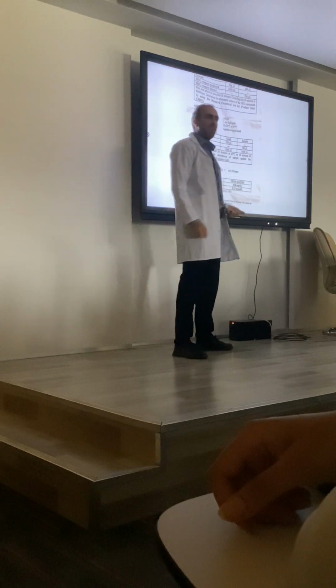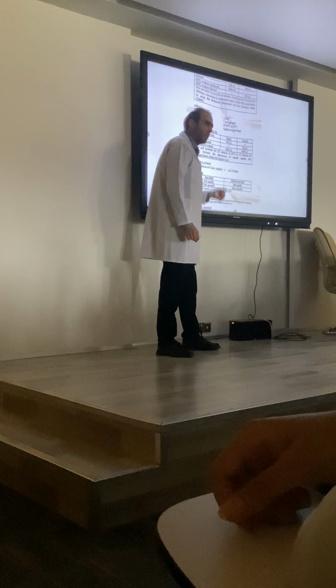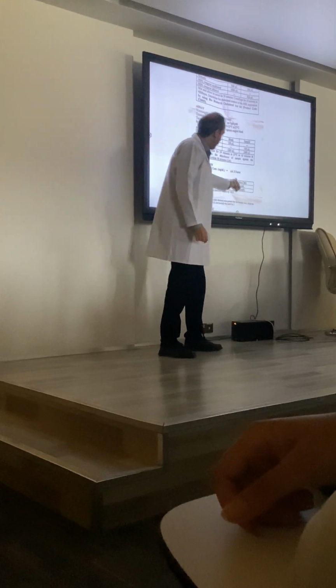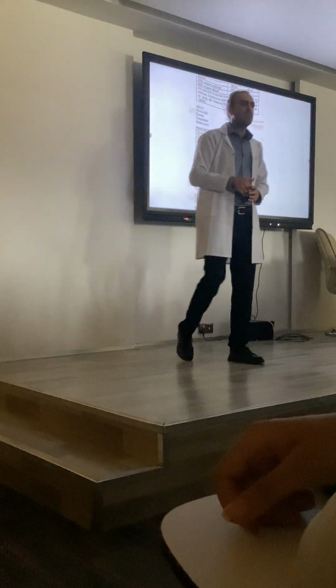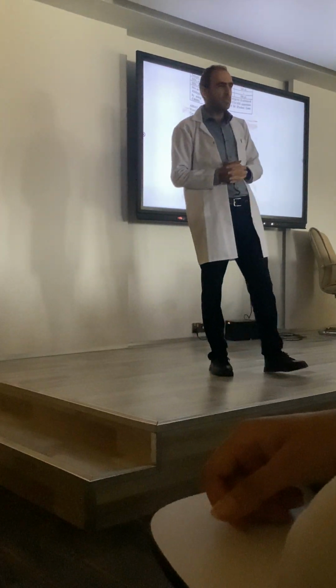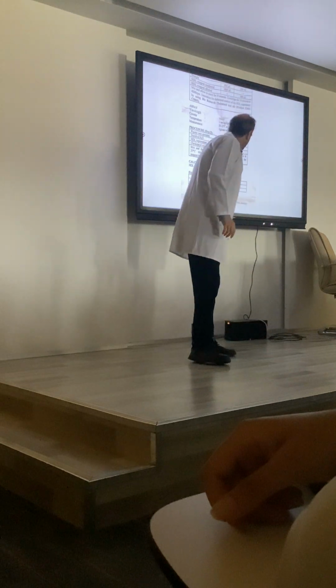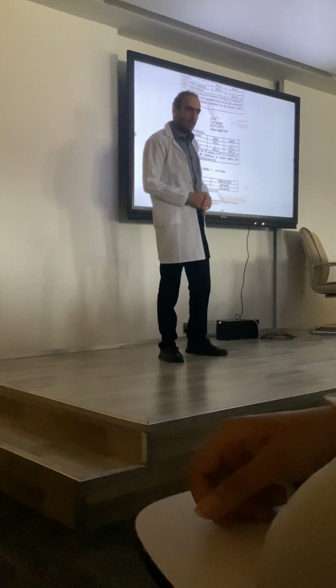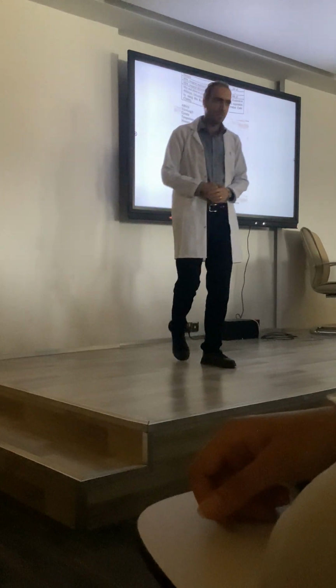Absorbance multiplied by factor. Factor for macro is 274, for semi-macro is 320. We should ask them which kind of method they used for providing the supernatant, and after that you have to divide it by that. I think they use semi-macro, so 320 should be used.